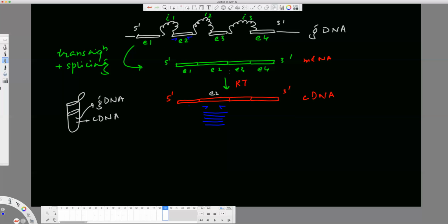Why? Because we are looking at how much this gene is expressed, so mRNA, which is reflected in the copies of cDNA. If I start amplifying genomic DNA also, then my expression profiling will be erroneous. There will be a bug in my readings. So how should I choose my primers to get rid of genomic DNA?